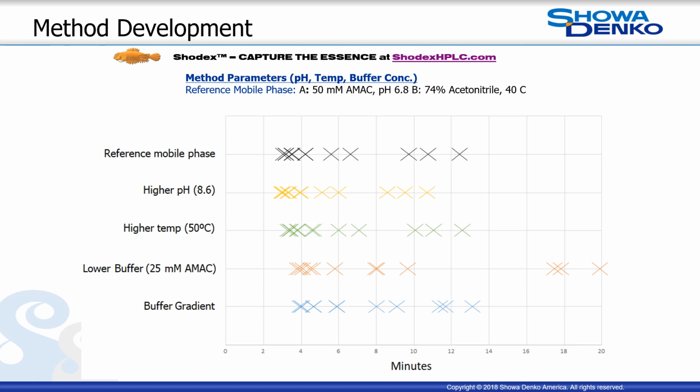Long-chain PFAS are very hydrophobic. They are more affected by the organic solvent versus the hydrophilic terminal groups and less affected by higher pH. Reducing the buffer concentration to 25 millimolar in this case has a similar effect for long-chain PFAS. A reduction in the buffer reduces the ionic interactions between PFAS and buffer. Again, the organic solvent, acetonitrile, increases the solubility and the compounds elute faster.